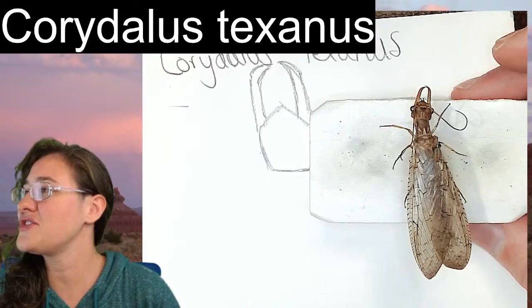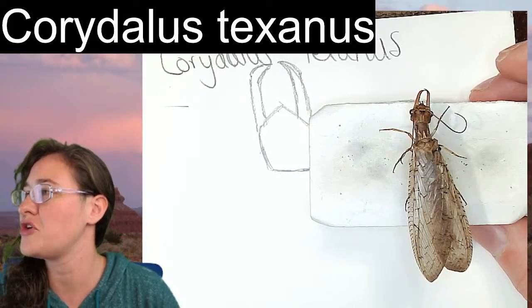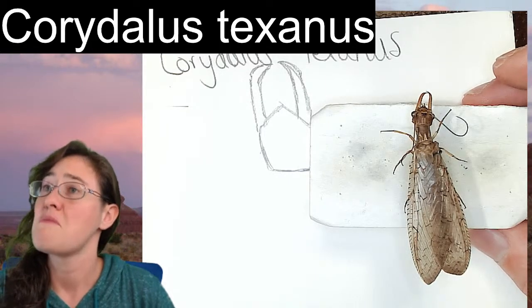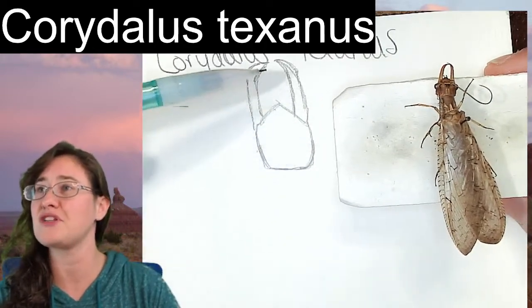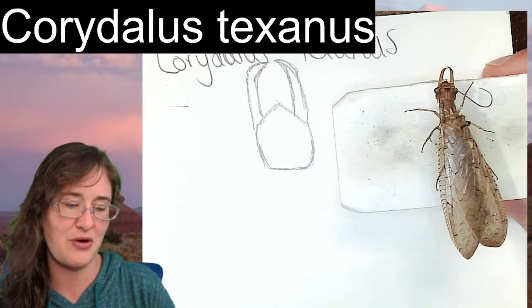So here you'd say the wings are 3/4 of the total length, with the pronotum, head and mandibles making up the last quarter. Yeah, I would say that's pretty close. So if you knew the length of your line, you could then just divide that 3/4 up.